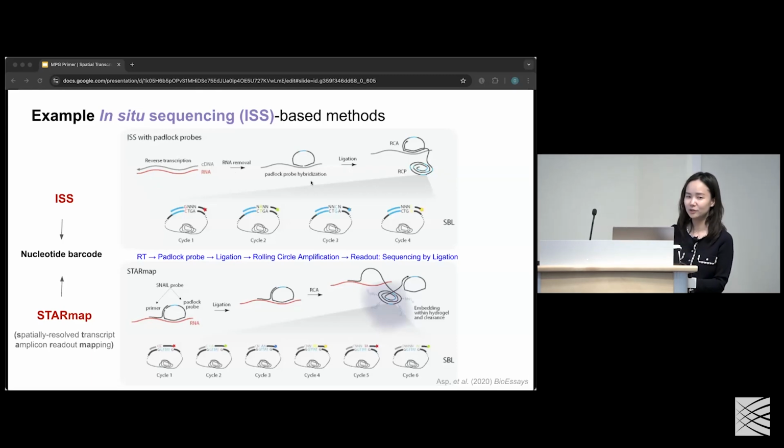And then finally, how do you actually read out the unique sequences that those probes bound to? There's going to be some sequencing by ligation. If these barcodes are 4 to 7 nucleotides long, there's going to be a sequencing primer, then a ligation of a fluorescence-based nucleotide that reads out what the nucleotide was at that position. So you're truly sequencing out the actual sequence, unlike MERFISH and seqFISH.